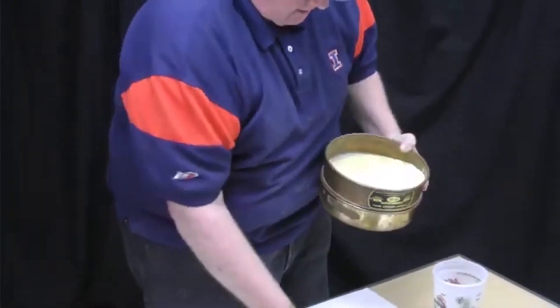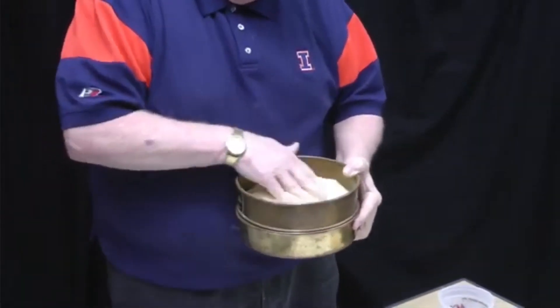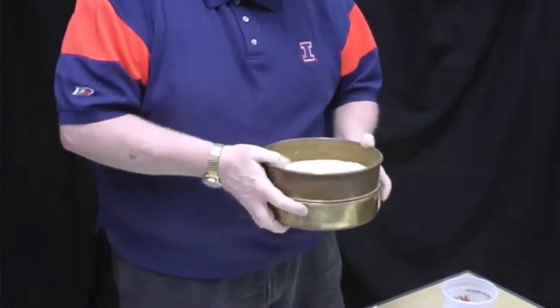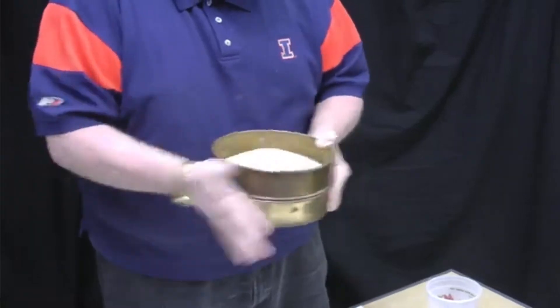We continue shaking the fourth screen, which is a much finer number 30 screen. You really have to work it and make sure it drives the flour through so it doesn't get hung up on the grain particles. Some people even bang it on the table to try to get it separated.